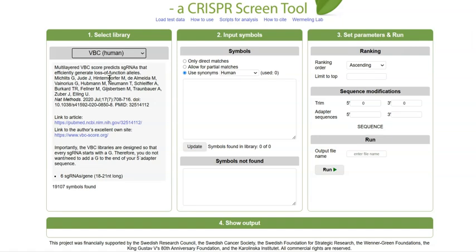As you know, it's a common sort of idea about conserved regions. And that will have a potential then a higher chance that if you do anything in that region, even if it's just an insertion or deletion and not the frame shift, that you will be able to generate the loss of functional allele that as they're talking about here.